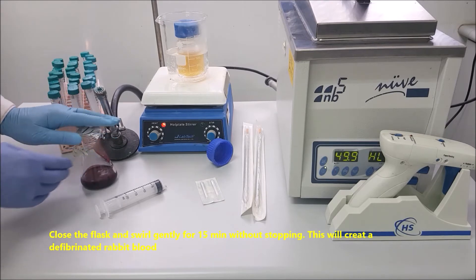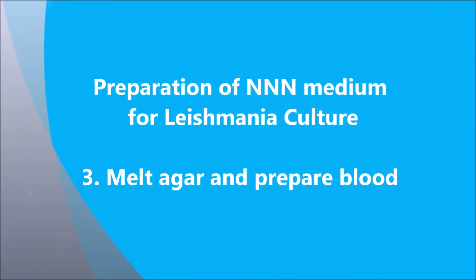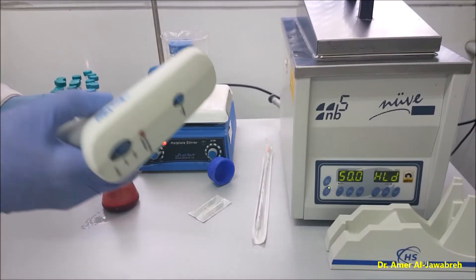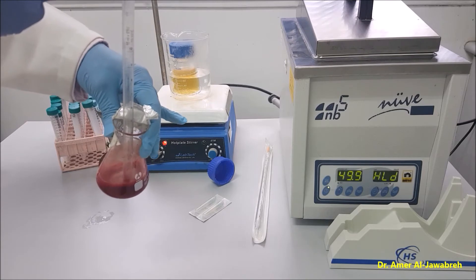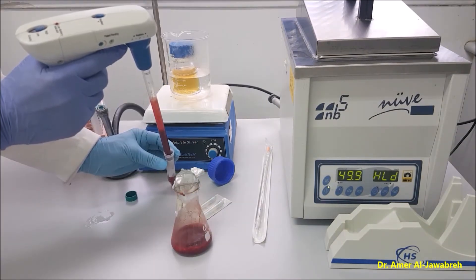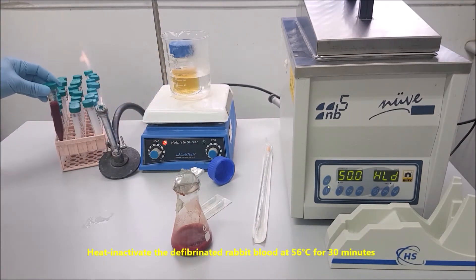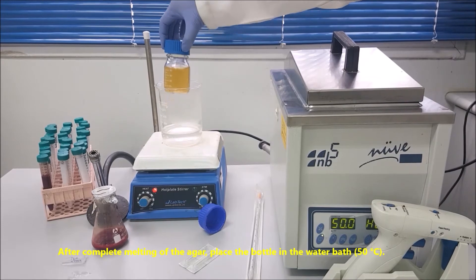Close the flask and swirl gently for 15 minutes without stopping. After 15 minutes of continuous swirling, aseptically transfer the defibrinated rabbit blood into a sterile tube. Heat-inactivate the defibrinated rabbit blood at 56 degrees centigrade for 30 minutes. After complete melting of the agar, place the bottle in the water bath at 50 degrees centigrade.